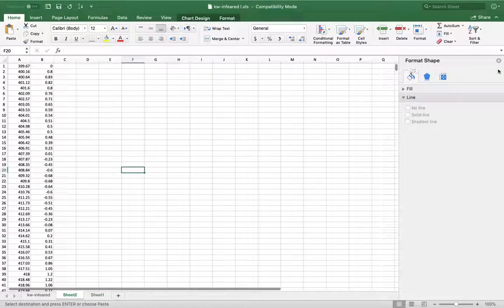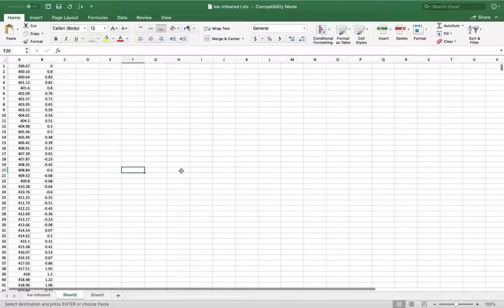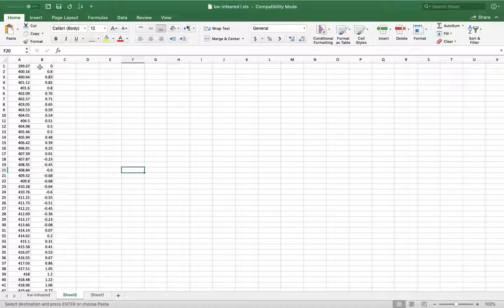Okay. Hi guys, for this video I'm going to be showing you how to create an IR spectrum graph using Excel. This is a fairly simple process. What I'm going to be showing you is for my unknown compound that I was able to generate the data for. Yours will be different than mine obviously, but that's beyond the purpose. I guess I needed to clear the air on that.